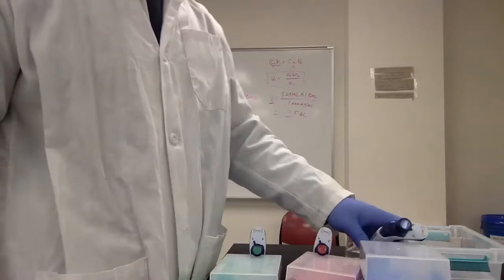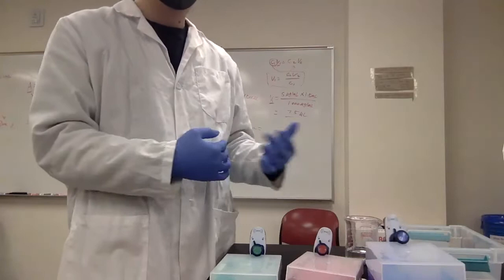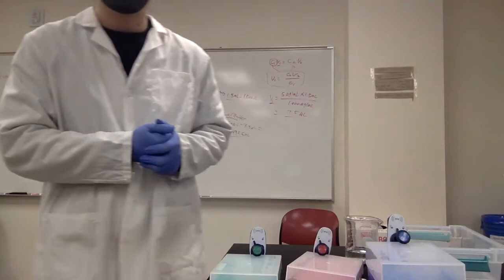All right, any questions about using the pipette? It is very important because we will use this instrument in every single lab this semester. Okay.